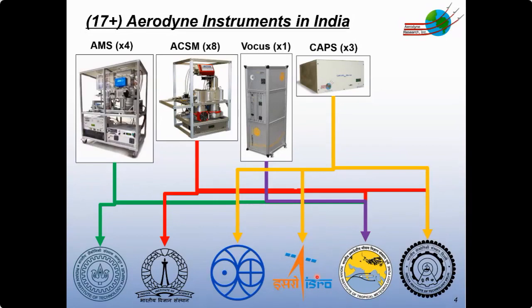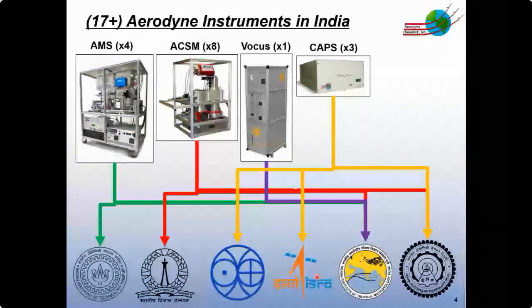We have delivered 3 cavity attenuated phase shift analyzers that are configured in different ways to either measure the aerosol extinction and scattering, or it can be configured as a gas phase analyzer to measure NO2 mixing ratios in the air.